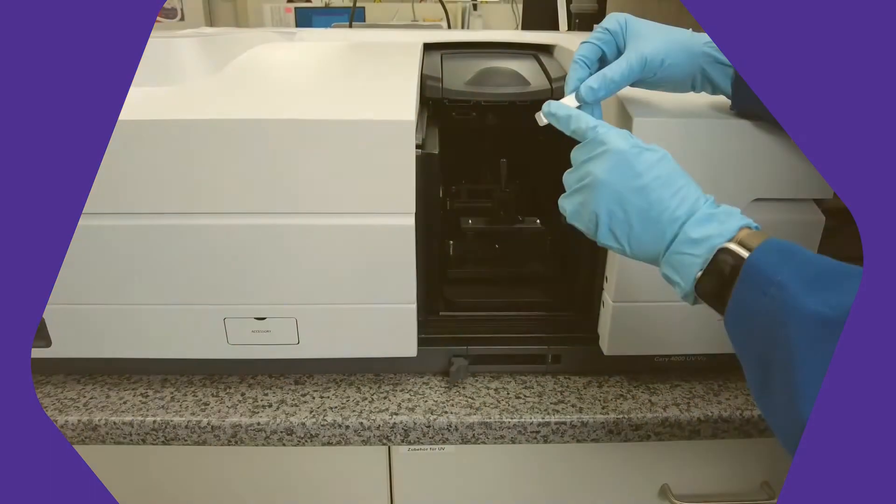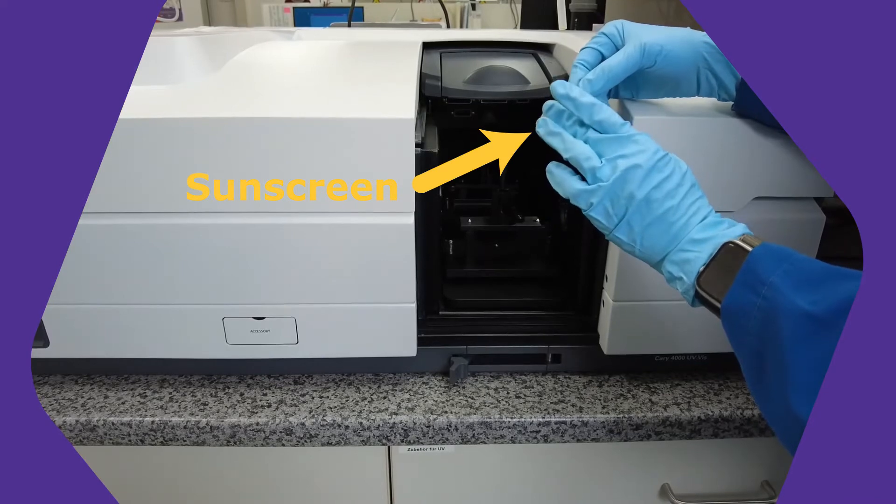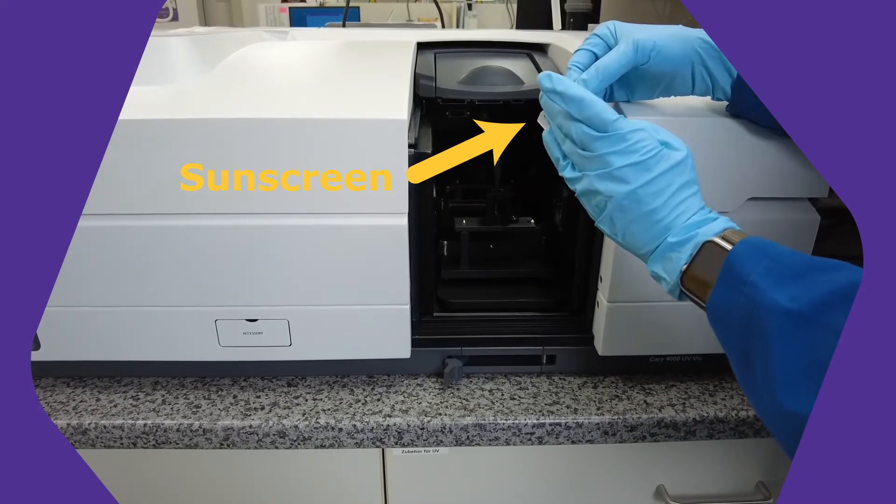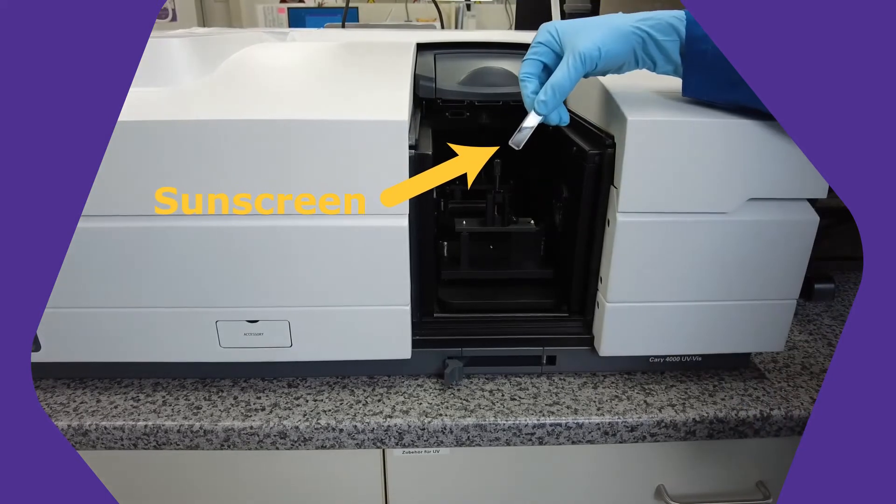After that, I put a very thin layer of sunscreen on one side of the cuvette. We now repeat the measurement. The sunscreen will block some parts of the electromagnetic spectrum.